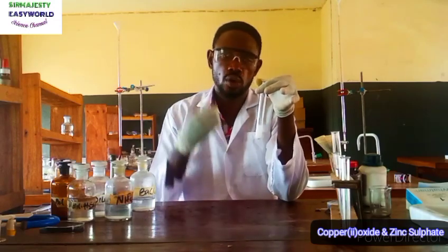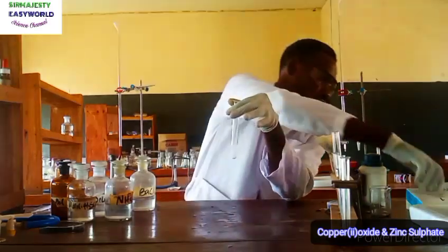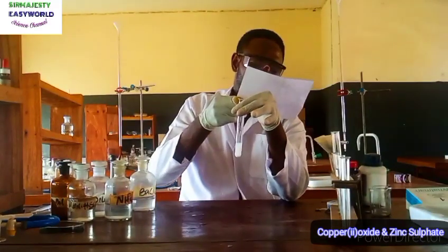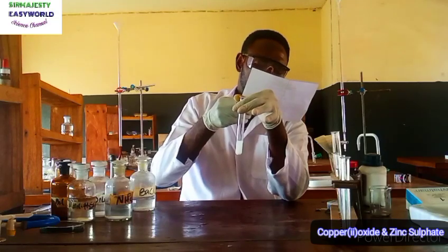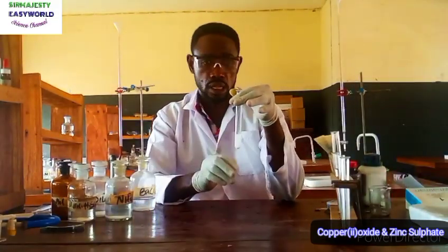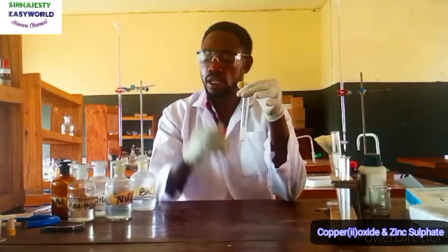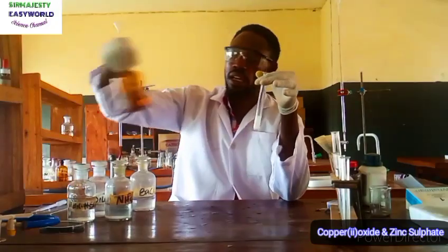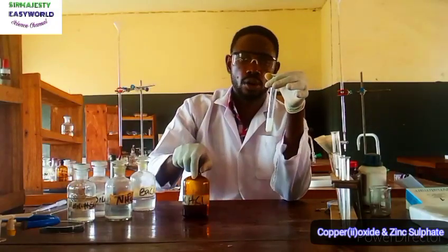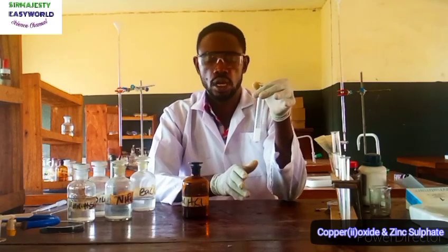Then, which reaction will tell you the one that is present? The next thing, according to the instruction, says barium chloride followed by excess dilute HCl. So it is the HCl that will tell us which among these three is present, or which two out of the three might be present. Now, the next is to add the HCl. This hydrochloric acid will now group these three into two.